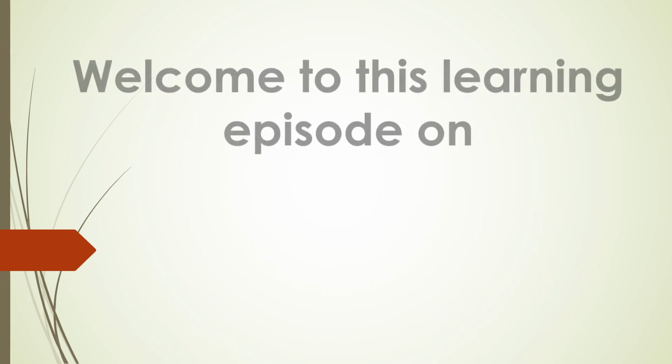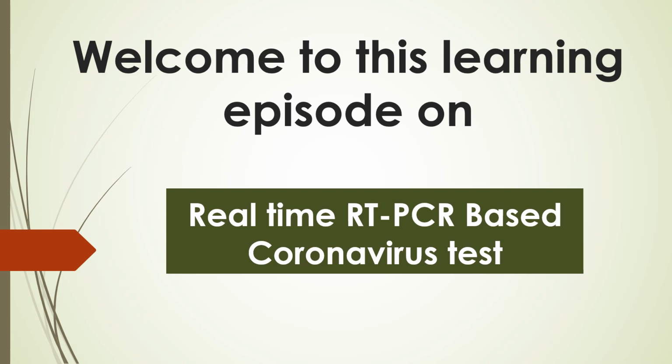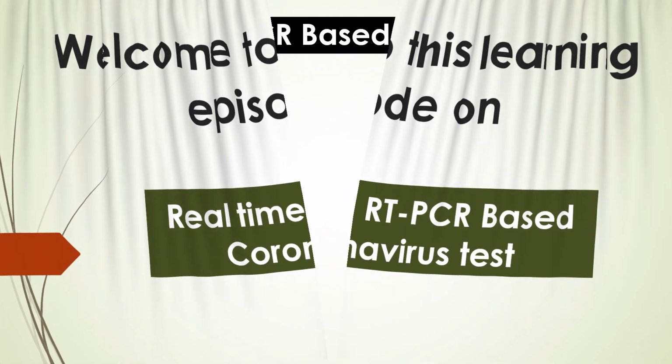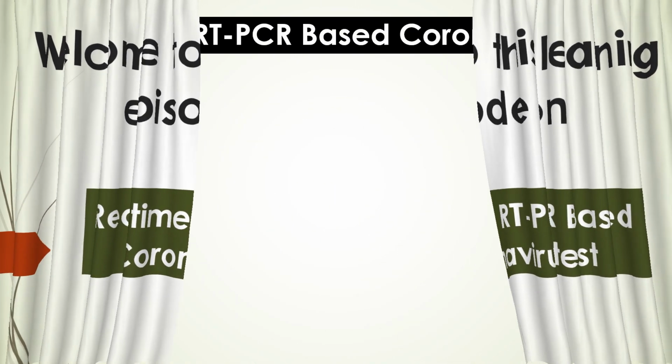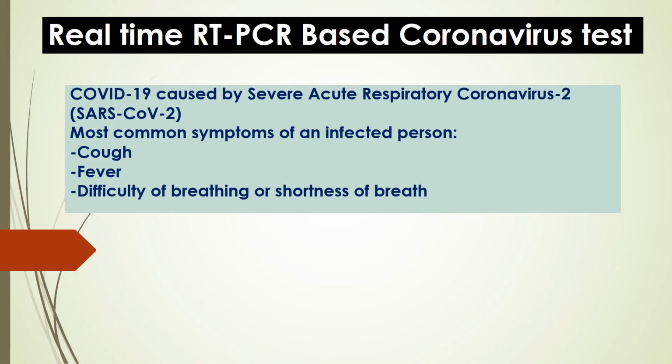Welcome to this learning episode on real-time RT-PCR based coronavirus test. COVID-19 is caused by severe acute respiratory syndrome coronavirus 2, also called SARS-CoV-2. Most common symptoms of an infected person are cough, fever, difficulty of breathing or shortness of breath.